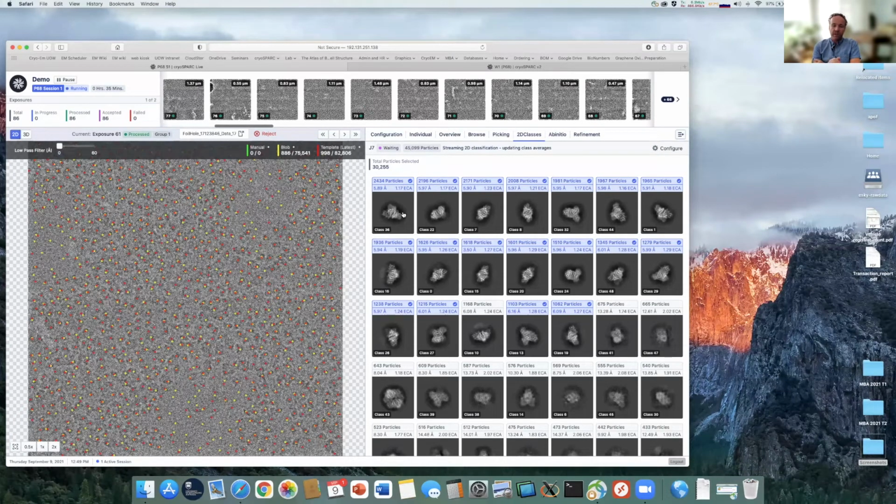Once it gets into the real in-depth processing of getting to that high resolution, and tweaking and masking and those sorts of things, that's something which people would do outside of the Live framework.